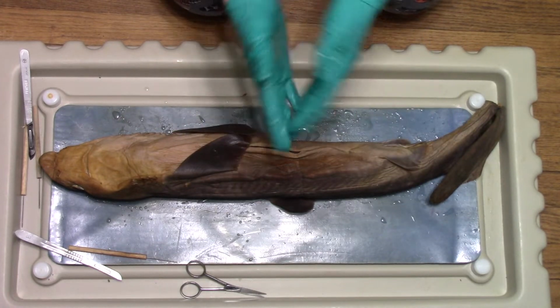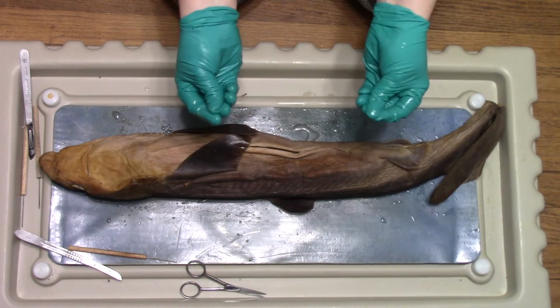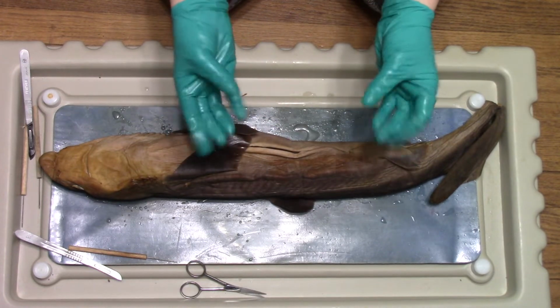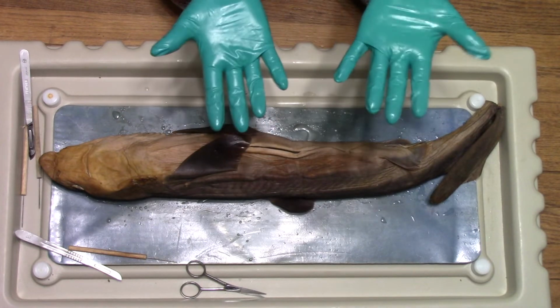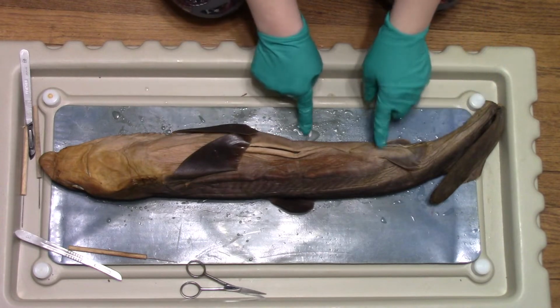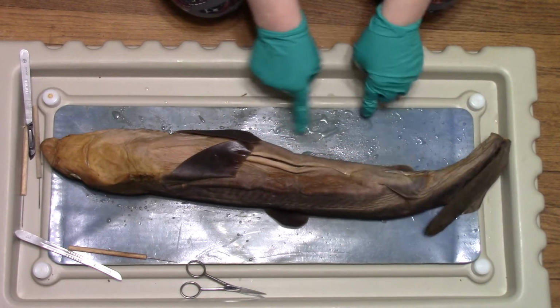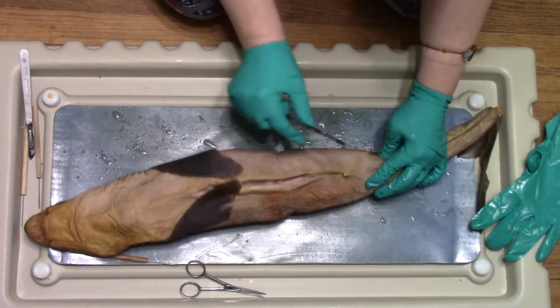One of the things I don't like about dissecting sharks is they're greasy. I can feel it on my gloves. Sometimes I don't bother with gloves, I don't care so much, but with sharks you can see it on the plastic here. It's so greasy. Okay.